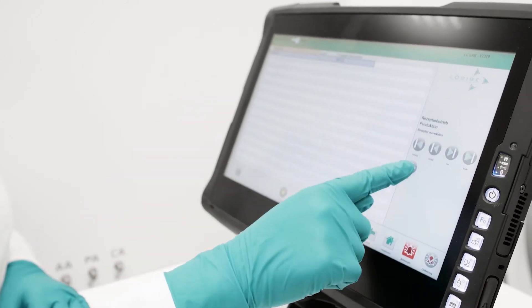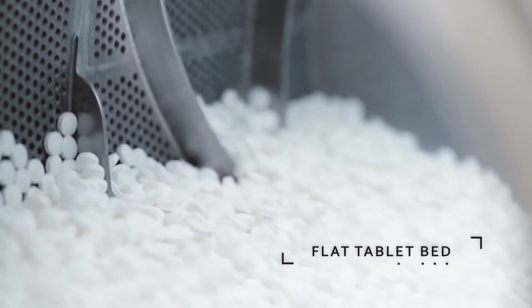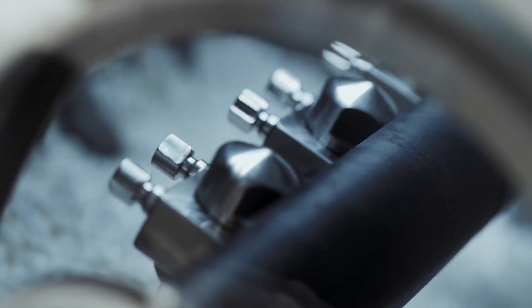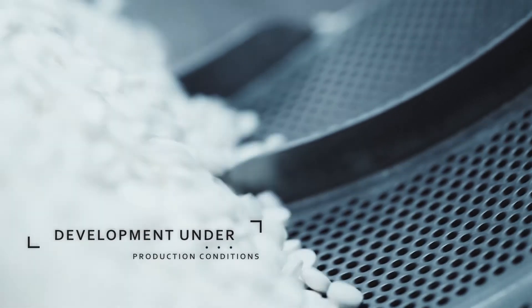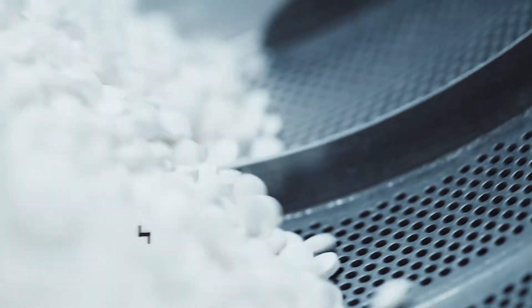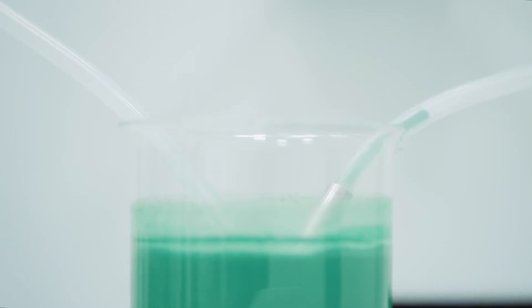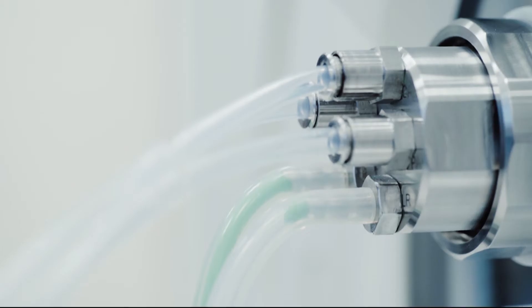Once all settings have been made on the operating panel, film coating of the cores begins. The drum geometry and nozzle selected for the LC Lab create production conditions like those in the Ludger production coater. The suspension is applied evenly throughout the entire length of the drum.